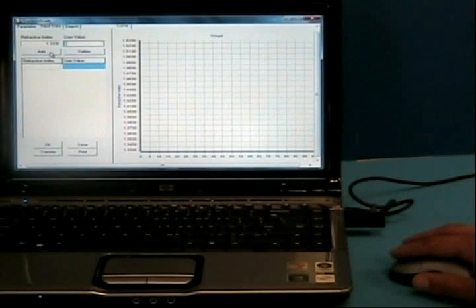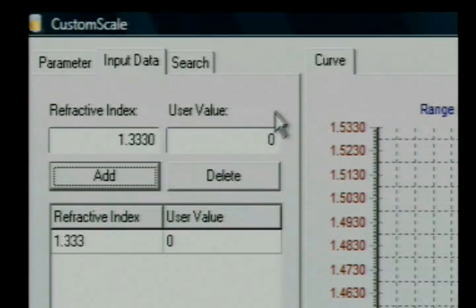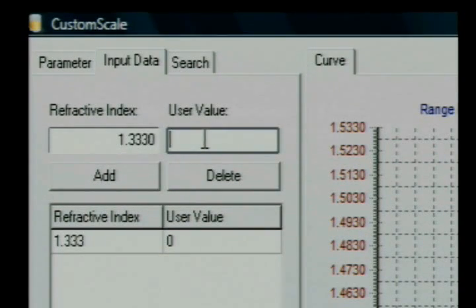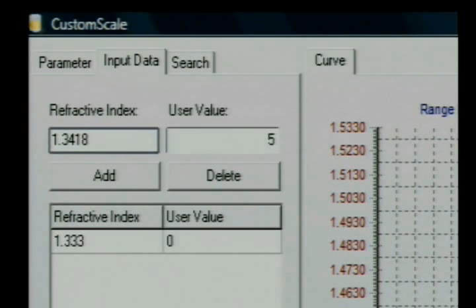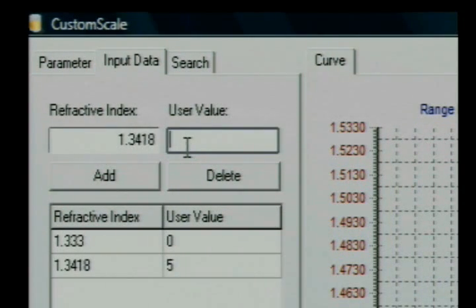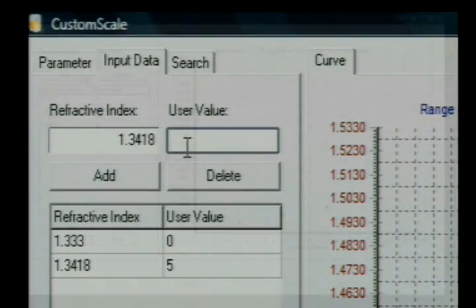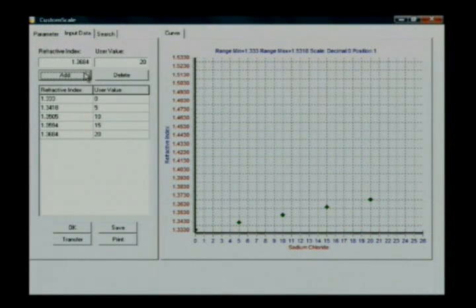To create your own custom scale, enter the refractive index values and your user value. In this case, we'll create a scale for sodium chloride, and the software begins to plot the results.